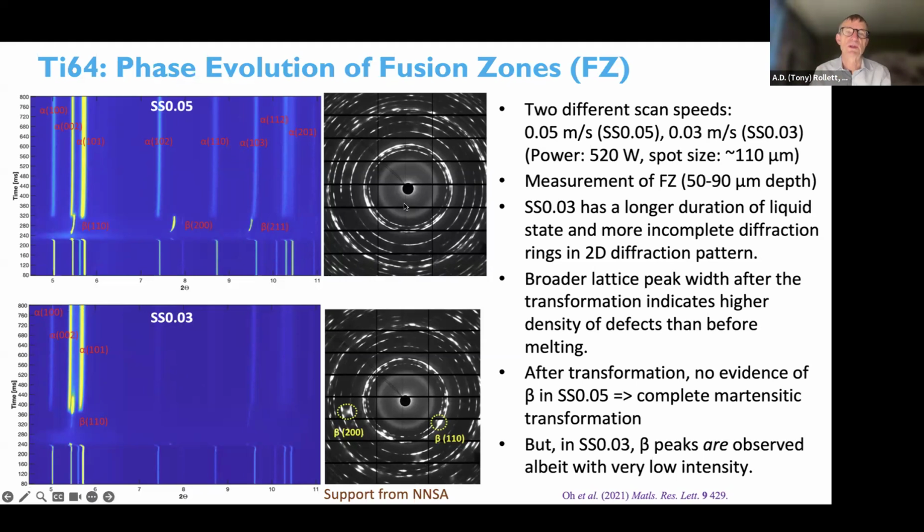You can see that we capture full rings out to reasonably high order. That, of course, depends on the setback of the detector from the sample. What we commonly do is collapse those rings onto points, or a line. So these streak camera-like plots have time starting at the bottom and marching up. Because of the high energy, the 2 theta values are quite small, and each line represents an individual reflection, which you can see indexed.